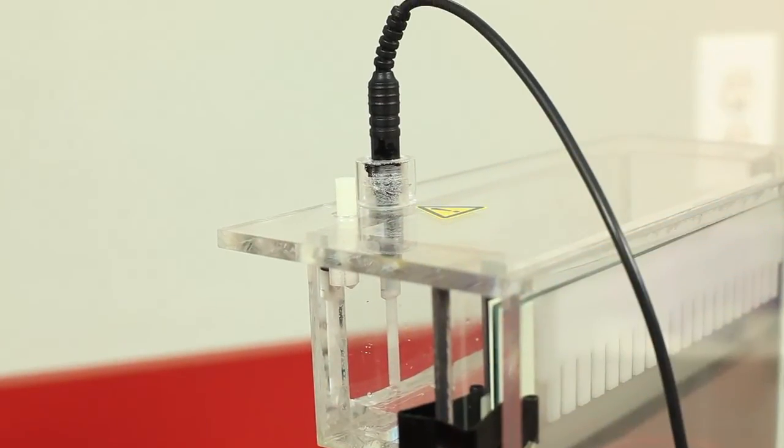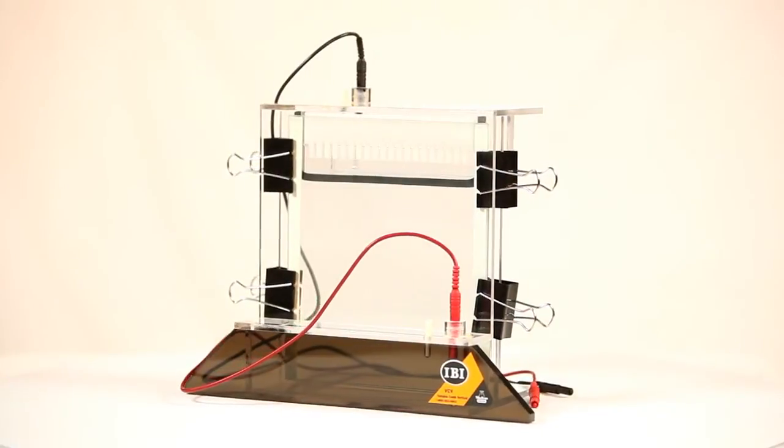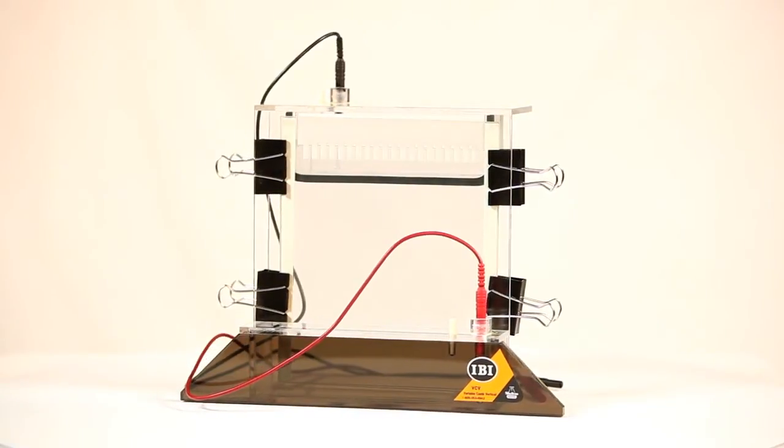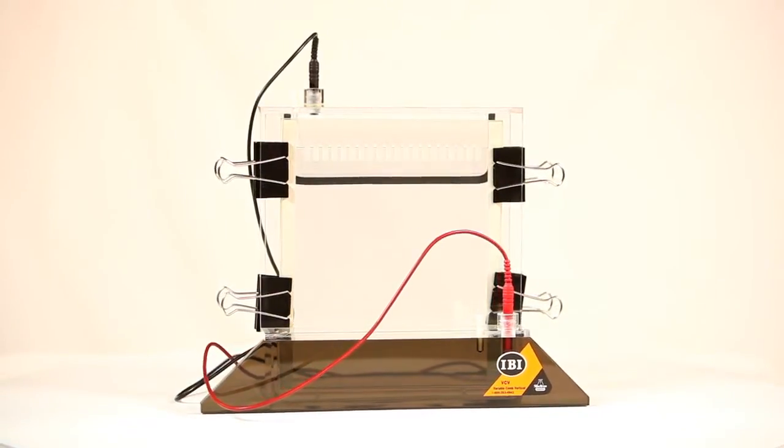With its simple yet effective design, the IBI Scientific VCV Electrophoresis System is a valuable addition to any life science laboratory.